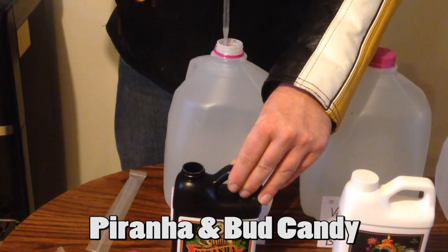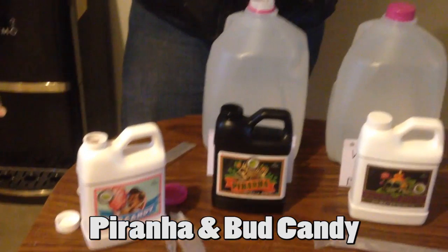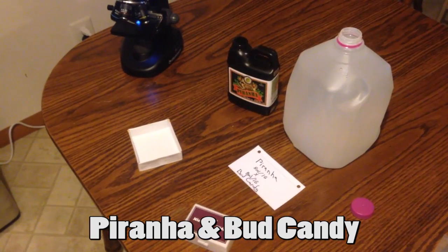In this video we'll be showing you a comparison of several microbial supplements under a microscope. Each will be diluted in a gallon of distilled water as per their instructions.